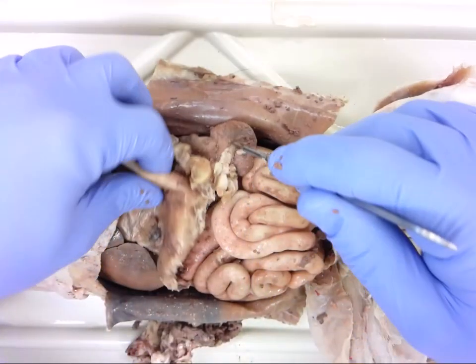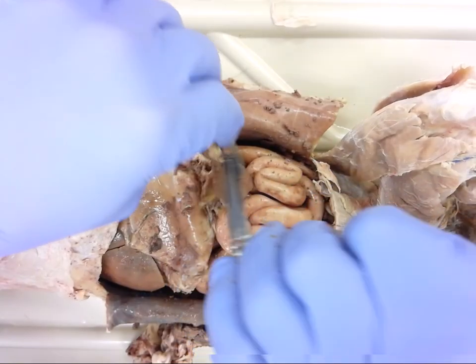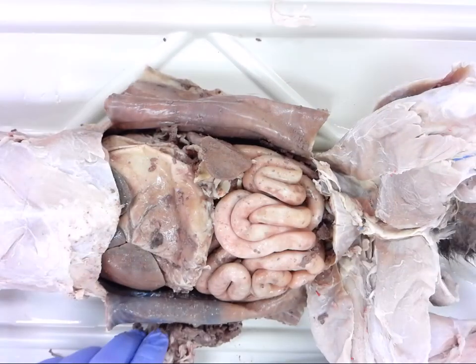Okay, so I have most of it out of the way. We can leave some of it. It doesn't have to be completely removed, but we do need to be able to find our abdominal contents.